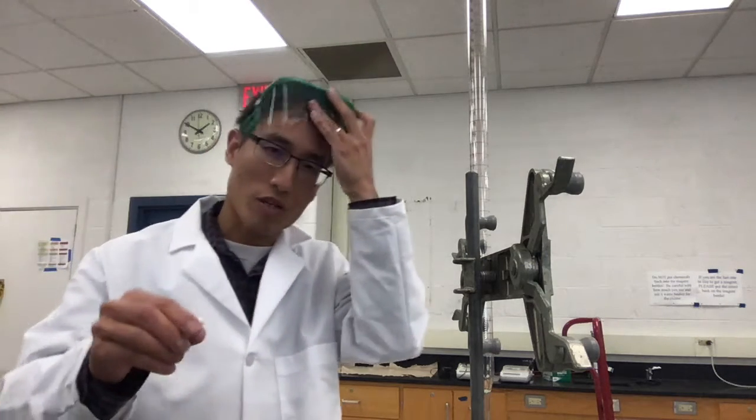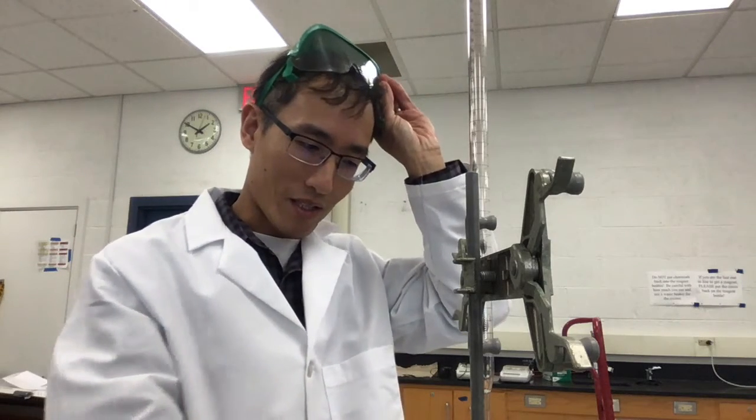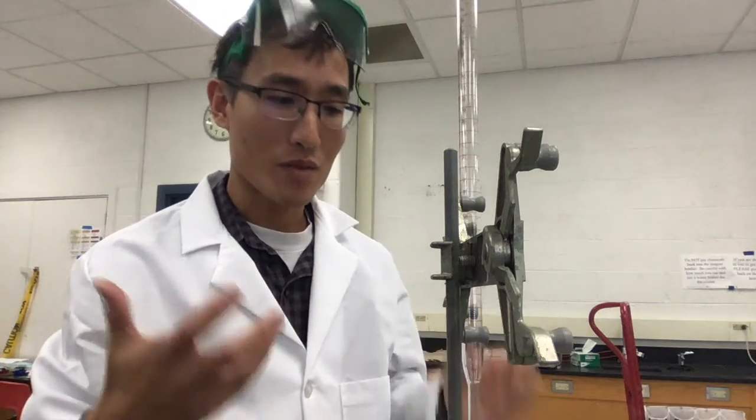If you take a stir bar, and you put it on a stir plate like this, and then you turn on the stir plate, you see there, it spins it around. And so you put that right into the solution, and it spins it for you. It stirs up the solution. That is how we keep things reacting, make sure everything is mixed up well.